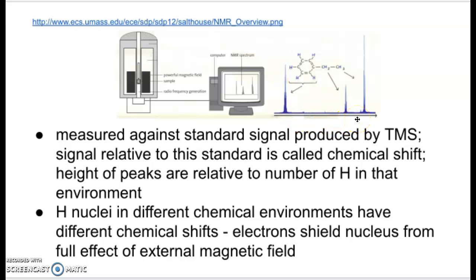So over here, it's a little bit more obvious. We have a CH3, that's this really tall peak, and a CH2, that's this smaller peak. So it's telling us that there are 3 hydrogens with the same environment, and here there are 2 hydrogens with the same environment. And this one hasn't been integrated, so it still has the area under the curve, but you can see that this one is taller, and on the exam questions, it would be a factor of 3, whereas this would be a factor of 2. So you would see that this was 2/3 the height of this, and so you would know that this had 3 hydrogens and this only had 2. And again, you'll see that when you get to some of the exam questions. They'll show you that a little bit more specifically.